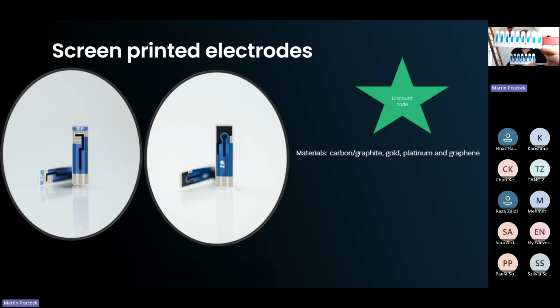So, these two that I'm holding up, carbon and graphite, are my personal favorite materials to use when developing assays. You've also got the choice of gold, platinum, and graphene. There's probably more as well, but these are the four main materials these days: graphite, gold, platinum, and graphene.